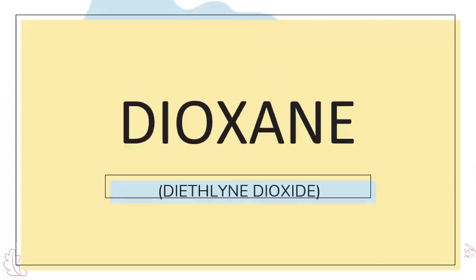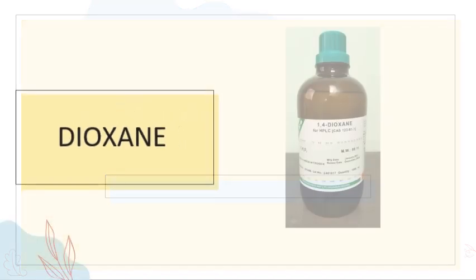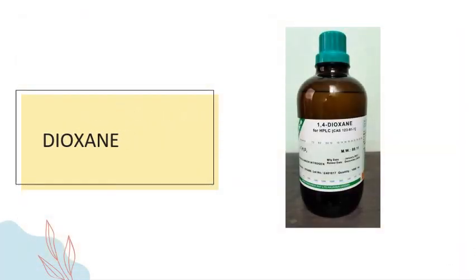The third dehydrating agent is dioxane or diethylene dioxide. This is an example.